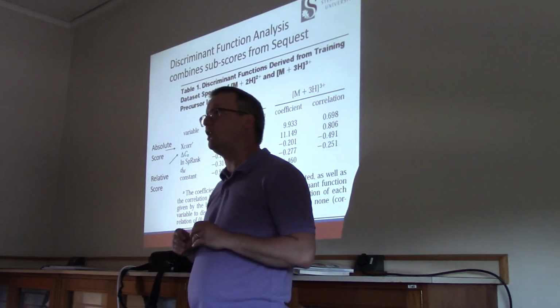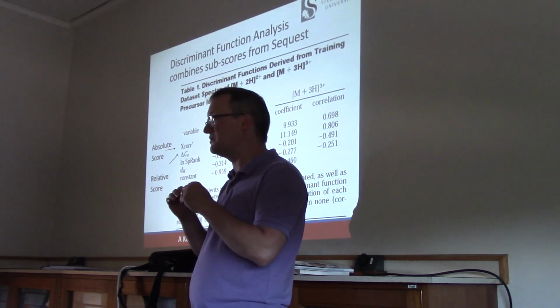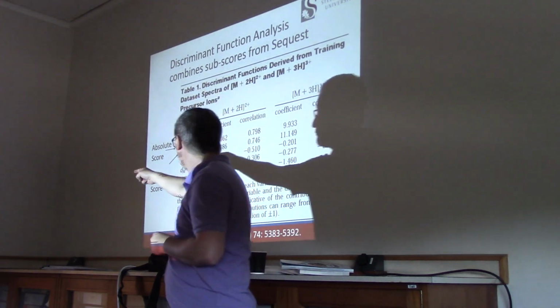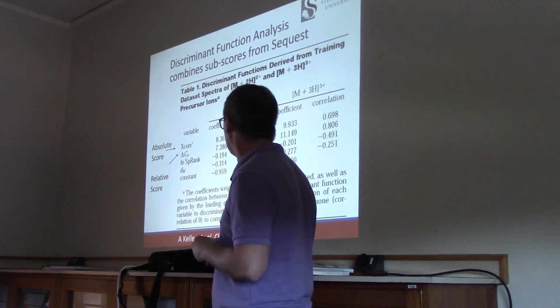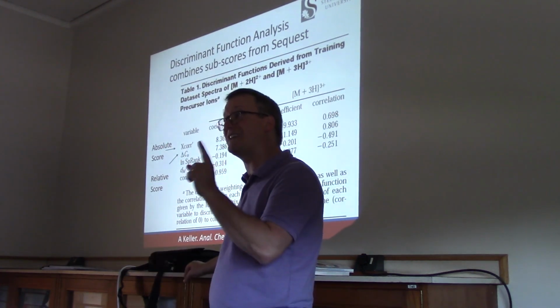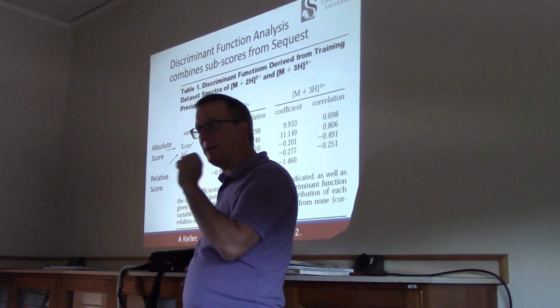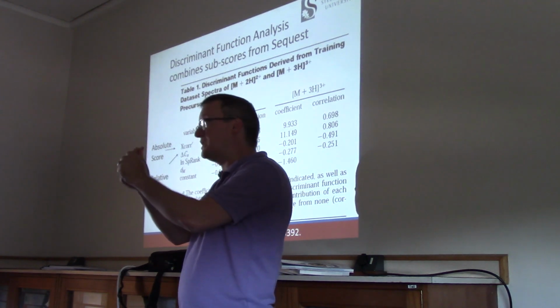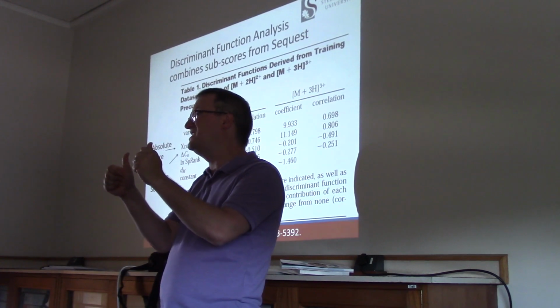It also has something called a preliminary score rank. Sequest has multiple scoring engines that it uses to score these matches. So it preserves information about that in the rank, where this peptide showed up in the original preliminary score ranking. DM probably looks like a kind of uninformative score, but in fact, it's very, very useful indeed. You see, if you're measuring the peptide ion's mass to charge value, it may be very close to what the peptide sequence says it should be, or it may be relatively far away. This is delta mass.